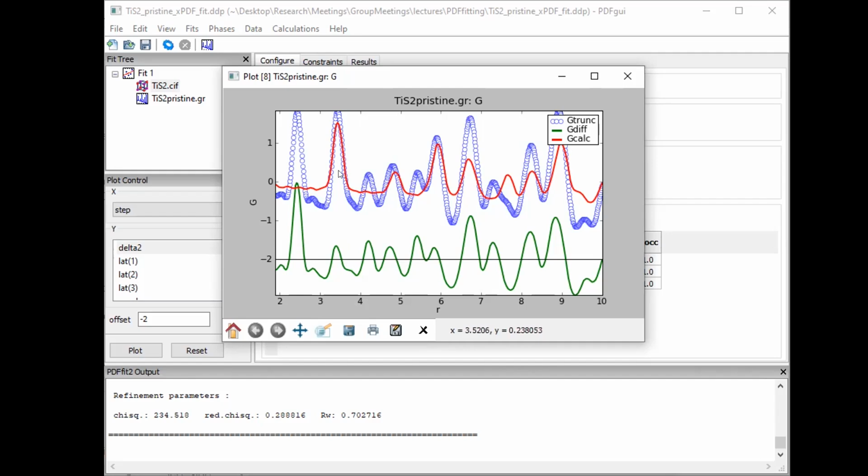And then we can reorganize our thought, and we may realize that, even though sulfur is light, in terms of X-ray scattering a small scatterer, there's so much sulfur in the titanium sulfur system. Its abundance makes the sulfur-sulfur bond have a lot of contribution to the second peak, right? And also you see the origin of these two peaks. This peak comes from sulfur, and this also comes from the sulfur, right?